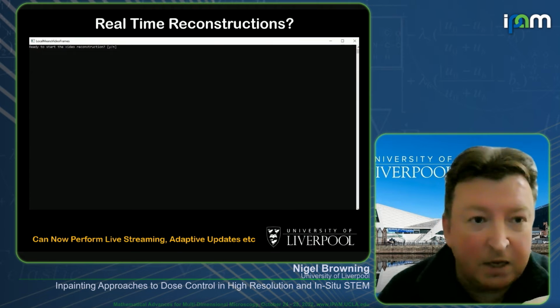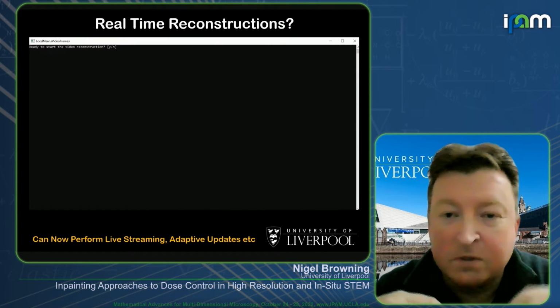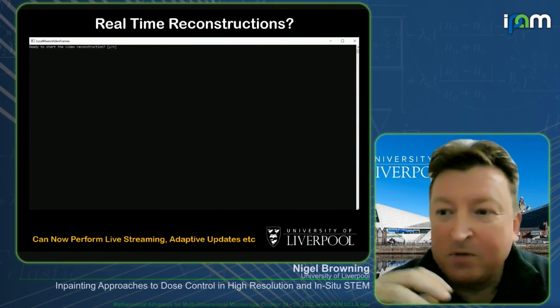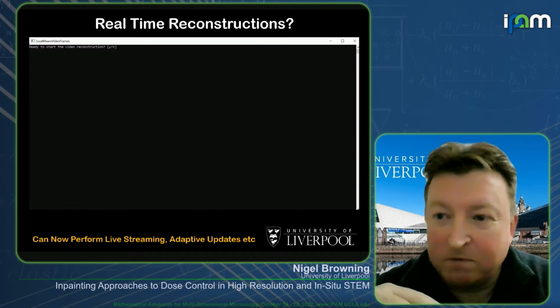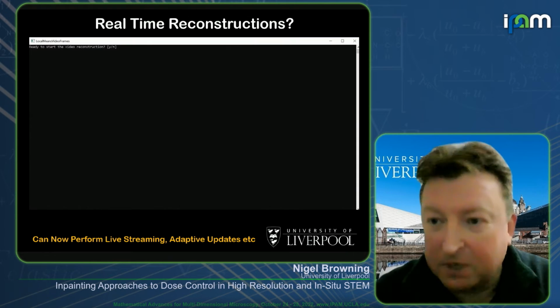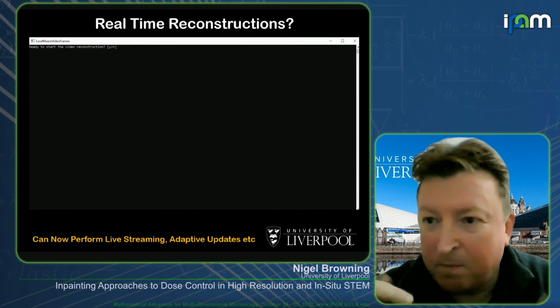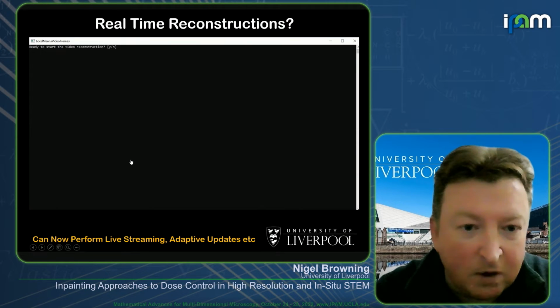So I've just got an example here, and I apologize for doing it as a download here from what's running on a computer. The reason for doing that is because every laptop, when you start to run one of these things, is actually using some of the memory to deal with the projection of the image and not the reconstruction. And so the only way to see a true amount of how quickly the reconstruction works is by actually looking at the thing running side by side with the real image.